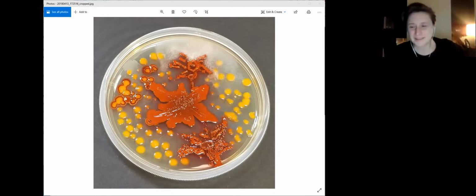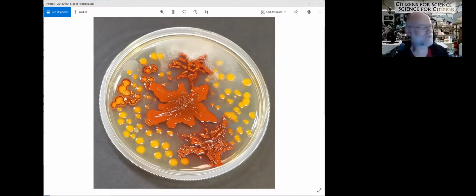Because these are natural strains, right? Yeah, these are natural strains. Another way you could get them to be less pixely is just to grow them longer so they meld together. I think we need to change the printing protocol somewhat, the inoculation part, because I've found that they grow themselves out after 2 days. I think maybe we start with a denser culture or something like that. Or maybe they need to be earlier.